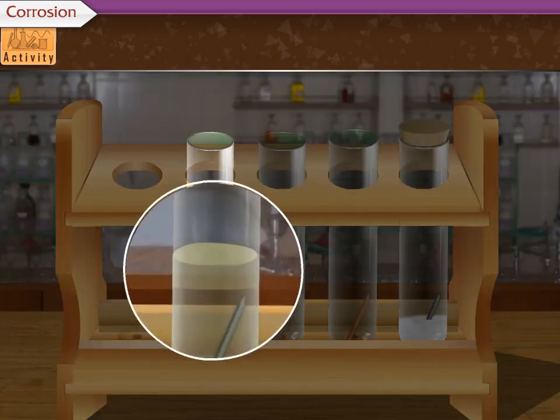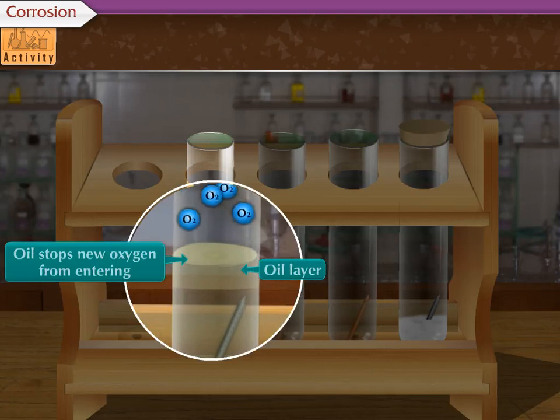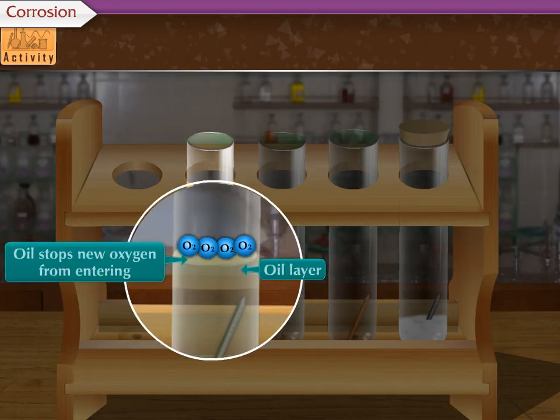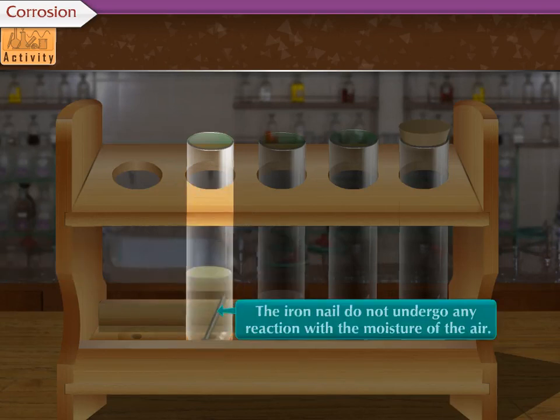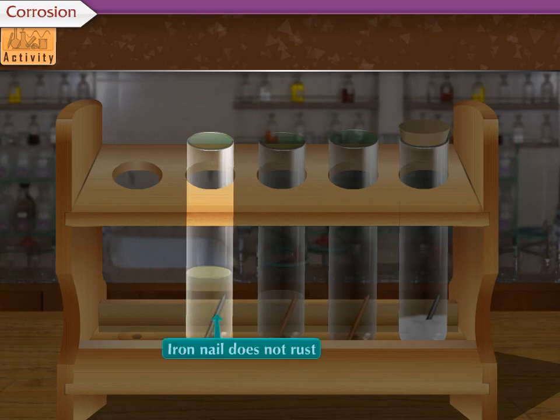In the first test tube, boiled water has no oxygen and oil stops new oxygen from entering. Due to this, the iron nails do not undergo any reaction with the moisture of the air. The result is that the iron nail does not rust.